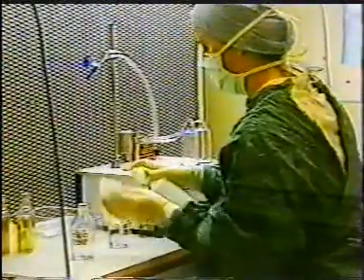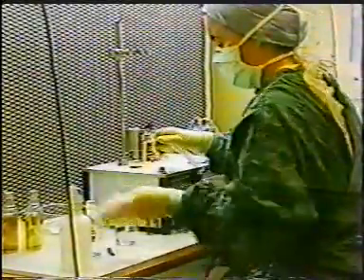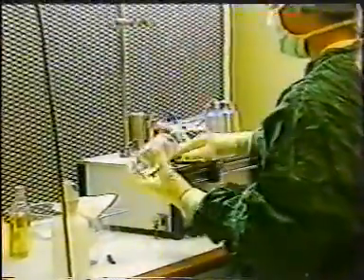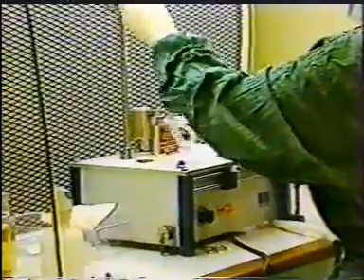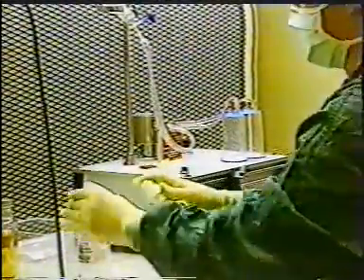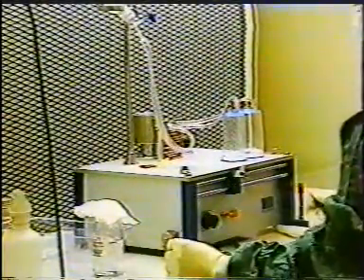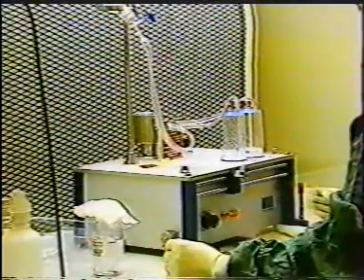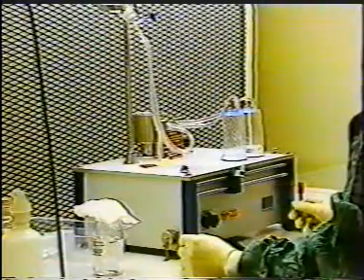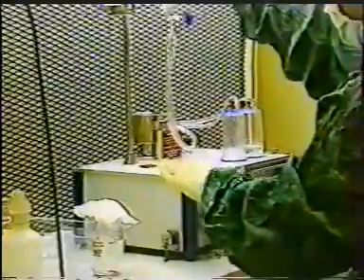In addition to chemical testing, it will also be necessary to carry out a sterility test on sterile products. The preferred method, which is being used here, is to filter the entire contents of the containers through membrane filters with a maximum pore size of 0.45 microns. Any microorganisms present will be retained by the filters. It is necessary to divide the sample between two filtration units so that two different growth media can be used in order to test for both aerobic and anaerobic organisms.